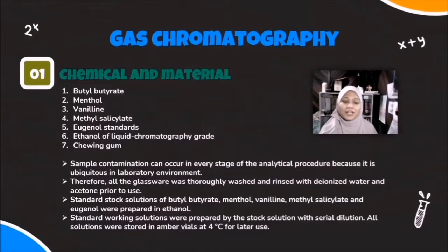First, chemical and material. We will use butyl butyrate, menthol, vanillin, methyl salicylate, eugenol standards, ethanol of liquid chromatography grade, and chewing gum. Besides, sample contamination can occur in every stage of the analytical procedure because it is ubiquitous in the laboratory environment.